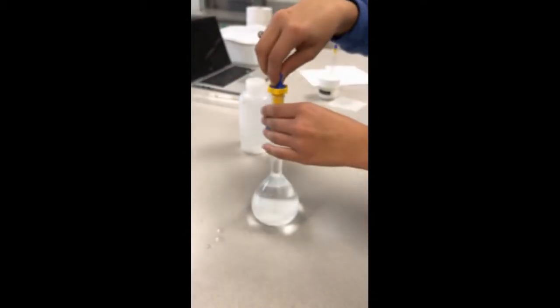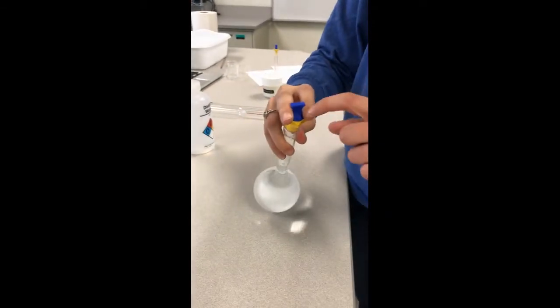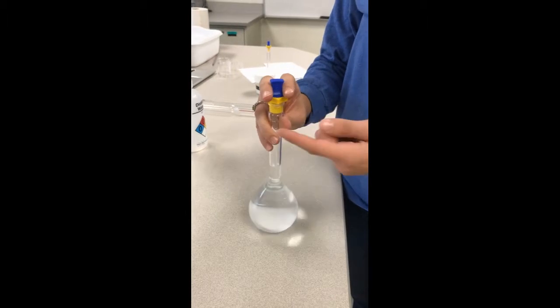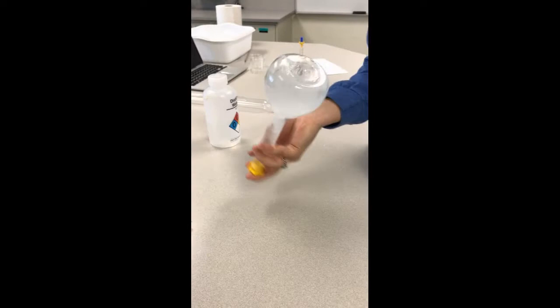And we're going to take the stopper and put it in the volumetric flask, holding it like this to make sure that the stopper won't come off and we won't spill the solution. And we're just going to invert it to mix it all.